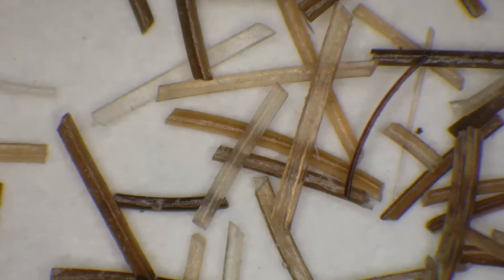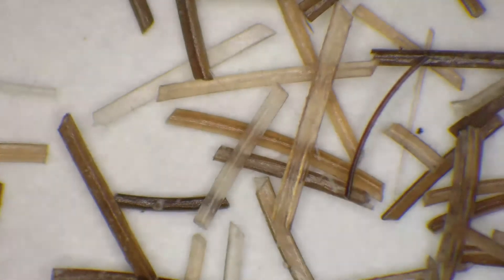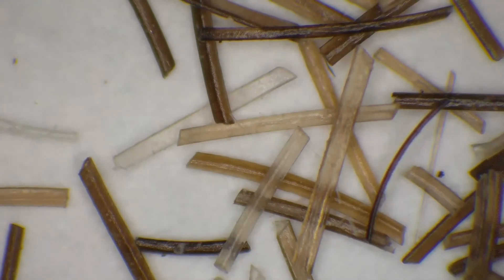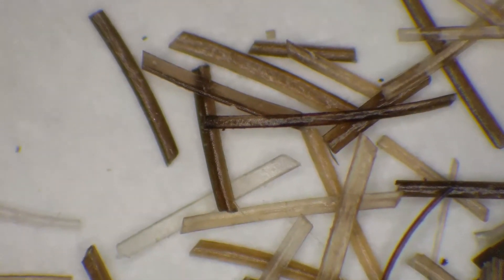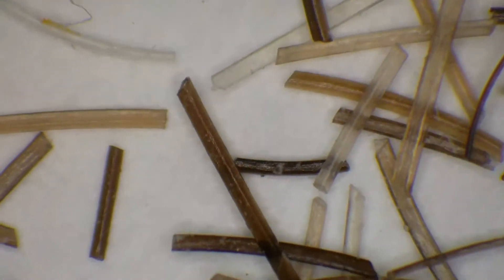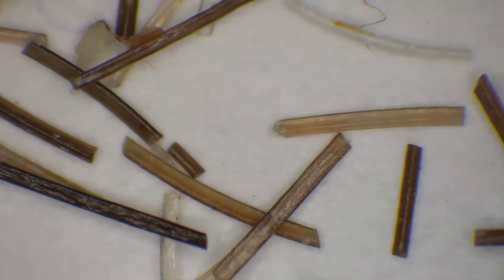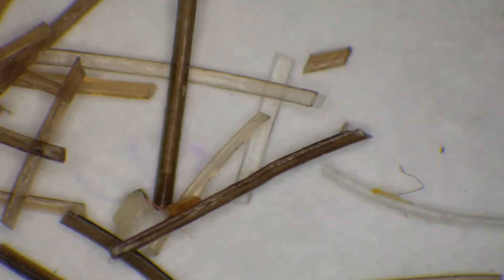So here we are at maximum zoom with the video microscope. It has about 120 times zoom factor and we can see that the beard is quite see-through.